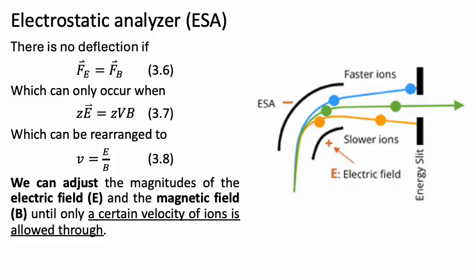And this is depending on what we're interested in. In the homework, I'll have you calculate different velocities for what is escaping the ion source. Then you can think about, okay, if a uranium atom has this velocity or a strontium atom has this velocity, how do I tune the electrostatic analyzer to let that velocity range through and not the other ones? Usually if you want to analyze multiple isotopes, you would put this somewhere in the middle of the different velocity range that you're expecting. And it filters out a lot of the ions that are at different velocities because they interacted with something.